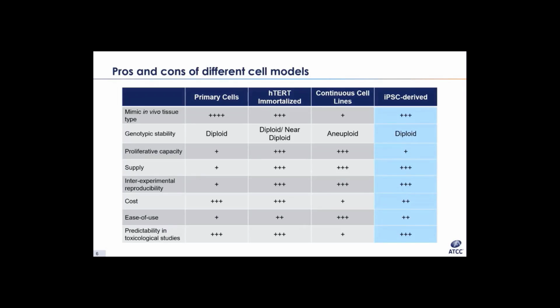So like I mentioned, I first wanted to talk about selecting the appropriate cell model for your research. As a researcher, one of the first questions you have to ask yourself is, which model is the best for my workflow? This table breaks it down for you.